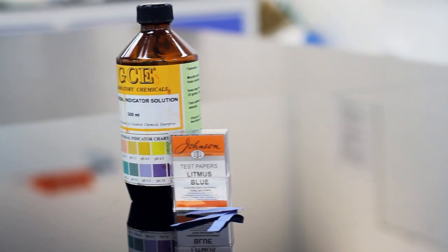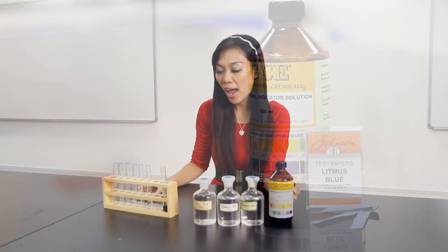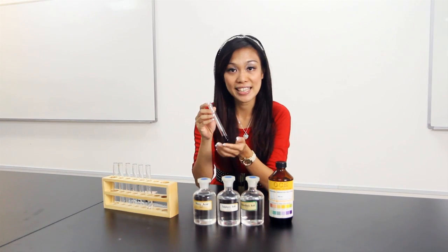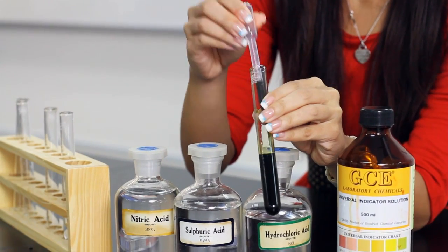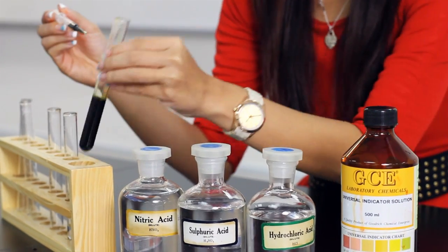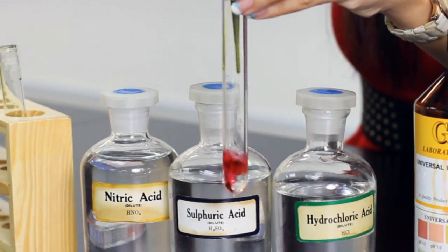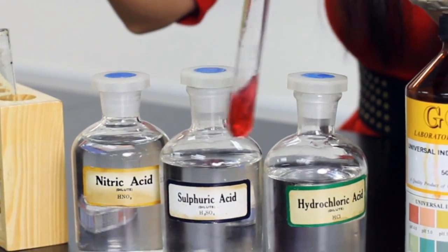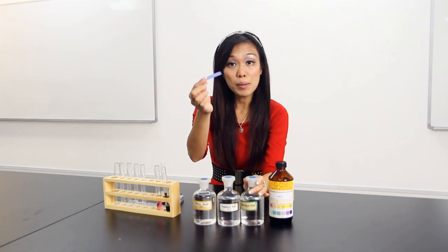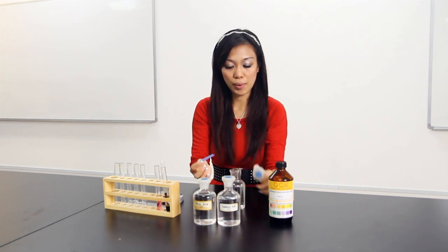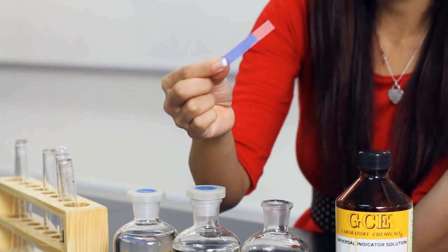You can use universal indicator or a litmus paper to test it. I have with me here universal indicator. It looks green because when it's neutral, it's supposed to be green. If I react it with acid, it turns red. If blue litmus paper touches hydrochloric acid, it turns red.